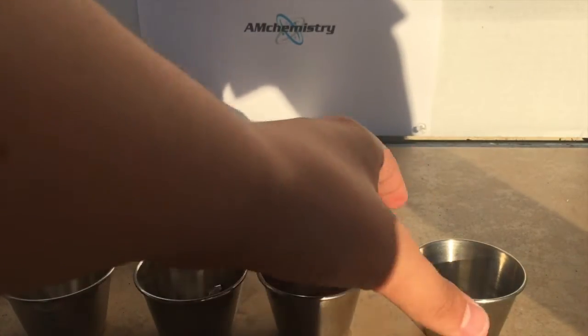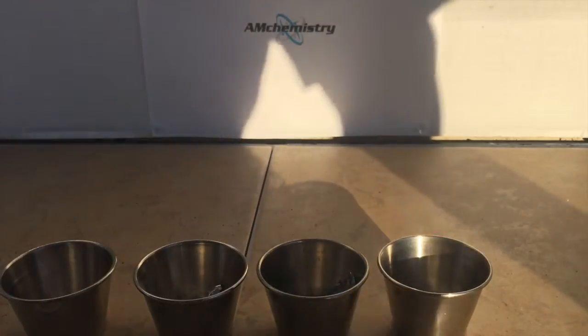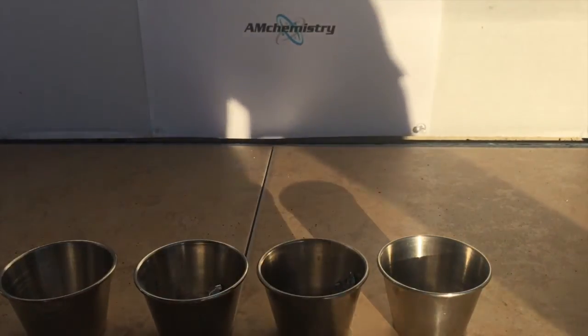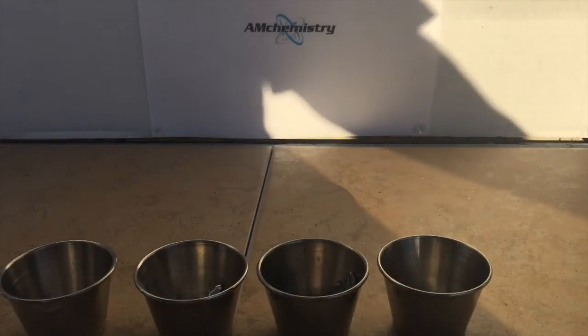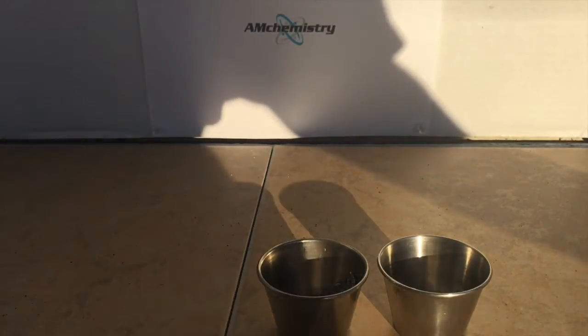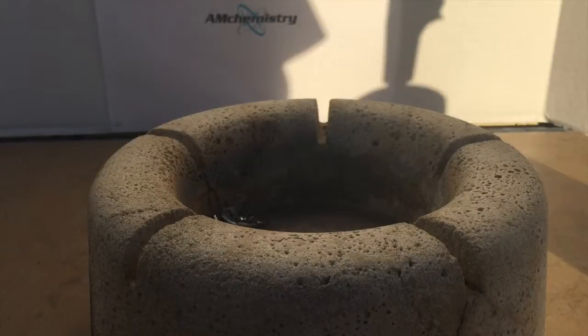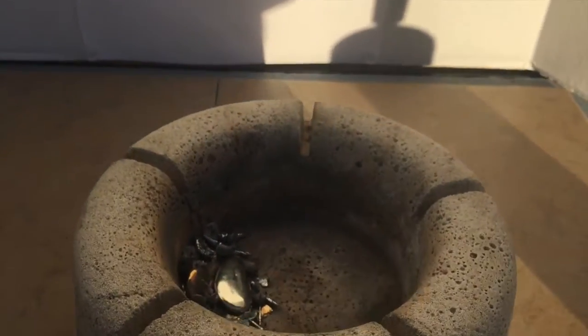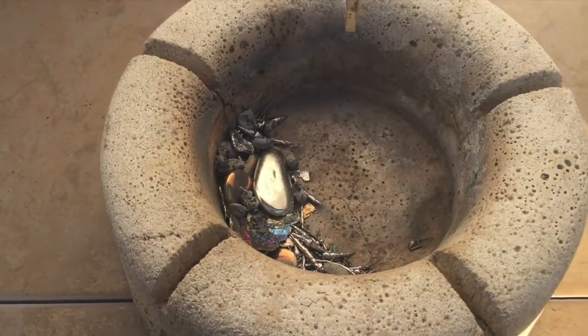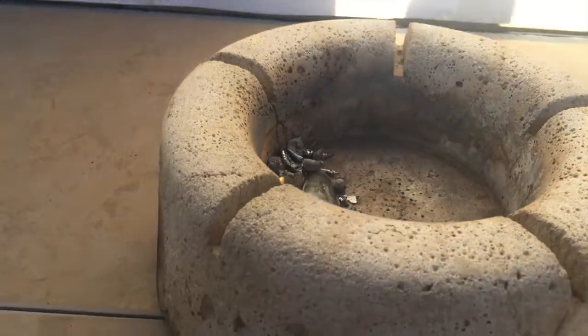lead, 50% bismuth and 12.5% tin. Now you just mix all the metals together in a container. Once all the metals are mixed together, just melt them together.